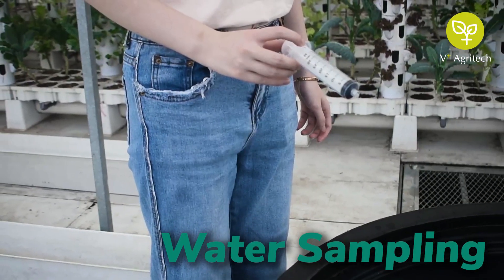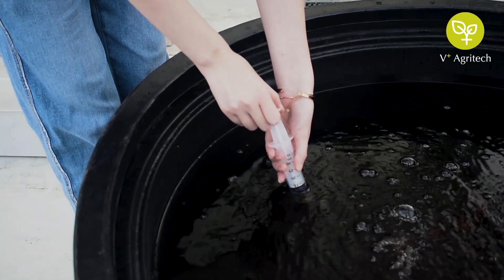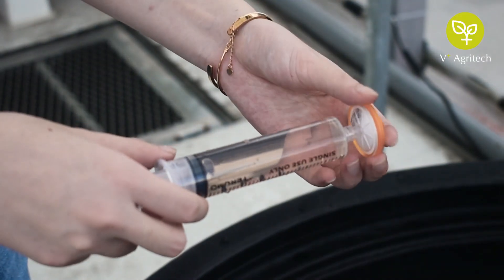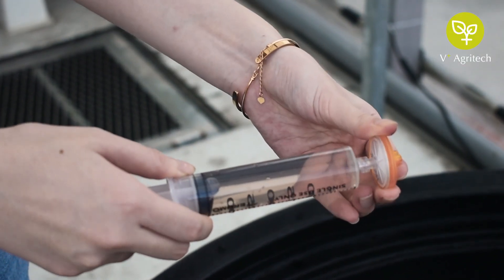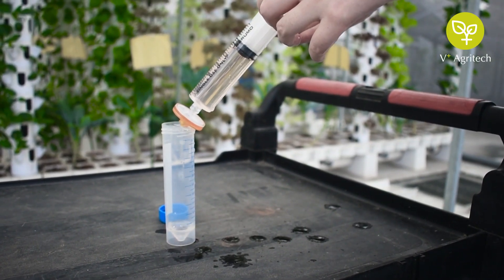Let's collect the water sample. Using the syringe, collect a water sample from the intended site. Attach the syringe filter tightly. Place the tip in the 50ml tube. Gently push the plunger to fill the tube.